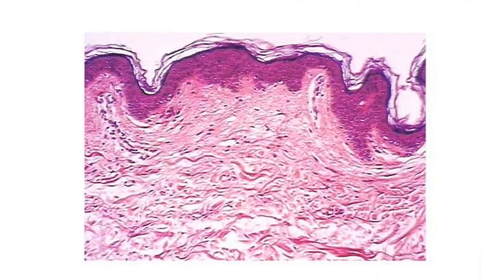This is a weird picture. Let's ignore the top now and just look down here. Again, if you're thinking that looks like epithelium on top, you would be right. So underneath it here, under the basement of the epithelium, must be some kind of connective tissue.